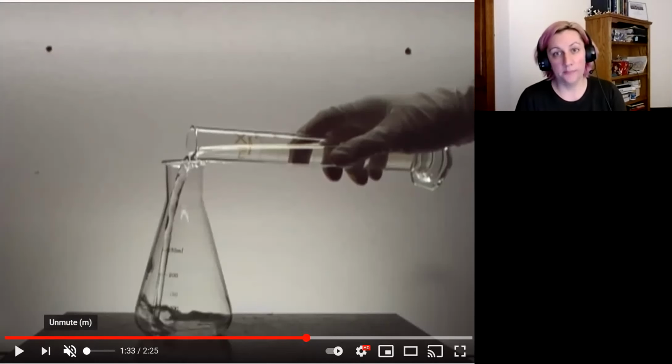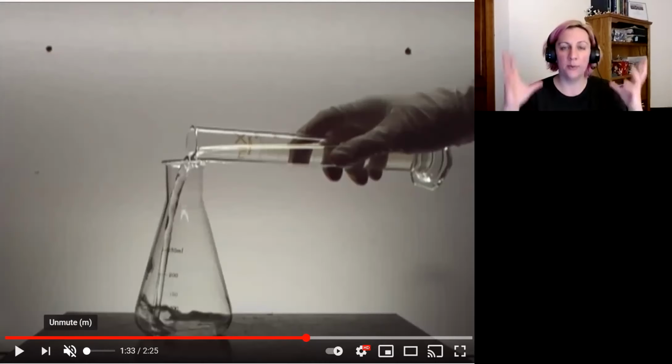In lab 4, we are going to be taking a pile of data from a series of reactions where someone studied the rates of the reaction of an iodine clock reaction. And so in the lab, we'll be processing the data and analyzing it and drawing conclusions. Normally, we would get to actually do this experiment in the lab.